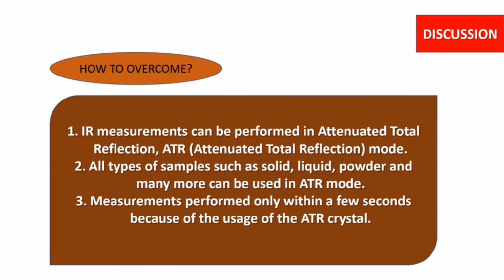All types of samples, such as liquids, solids, powders, or pellets, can be used in this ATR mode. The samples are placed on the ATR crystal, which is the medium for the ATR mode. The measurement is typically performed within a few seconds, really helping us save a lot of time.